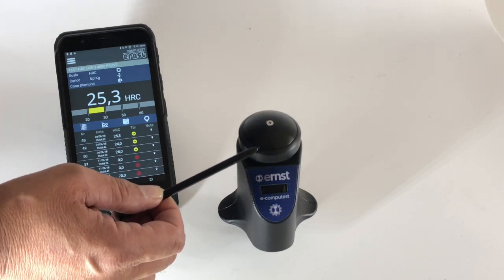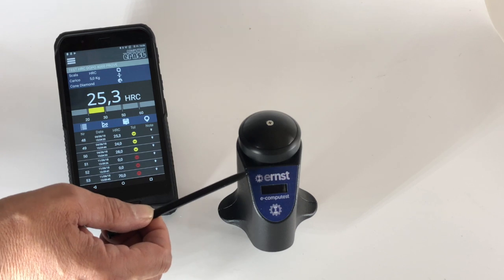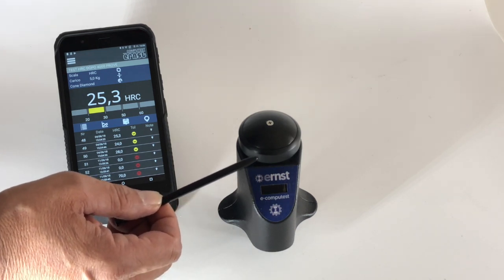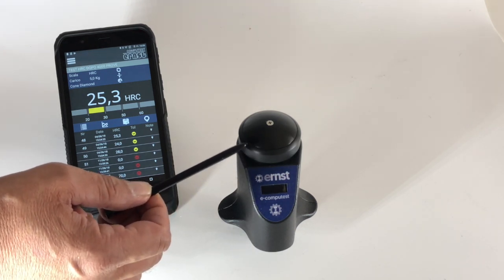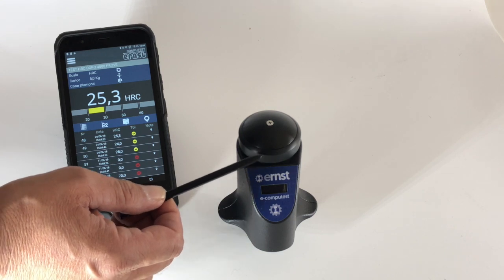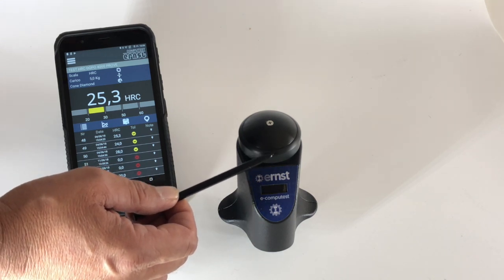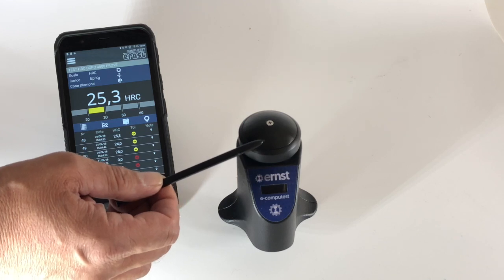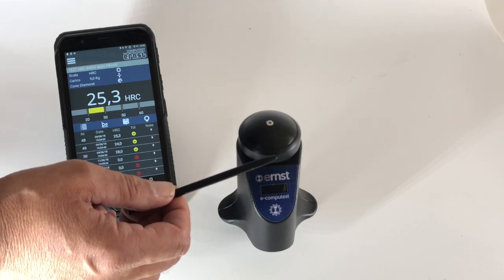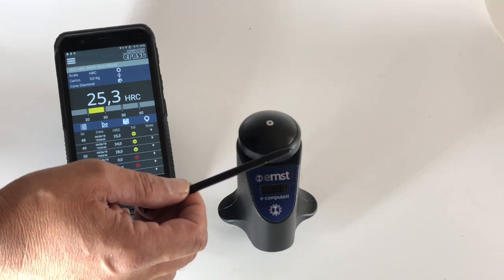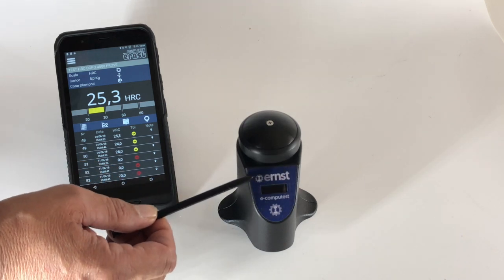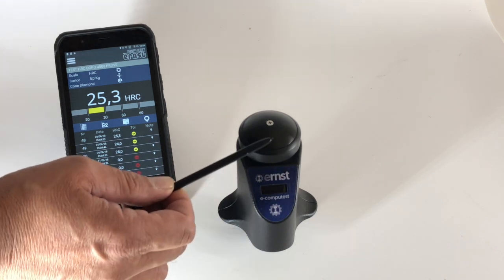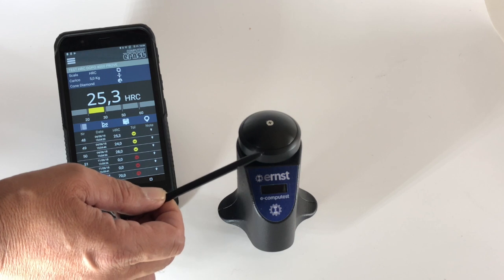We have all available scales. You can choose whatever scale you would prefer to use for your testing procedure. The system is not influenced by mass, and because of the five kilos load, it can measure less than one millimeter thickness.